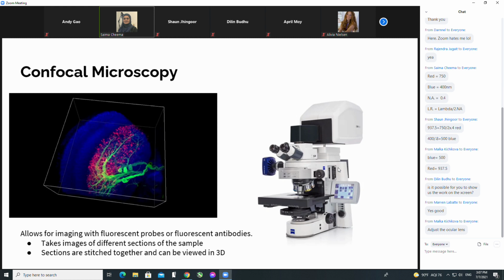So you can have a cell that's been sectioned into thin slices optically, like you don't physically actually cut it into 10 thin slices. You can focus at various depths within that cell, and you can have 10 different levels that you can focus in on, so you can see detail that right here we're seeing some of it, but you can see in this case, for example, we're seeing part of what looks like the brain, but certainly blood vessels and the particular cells that they are serving.